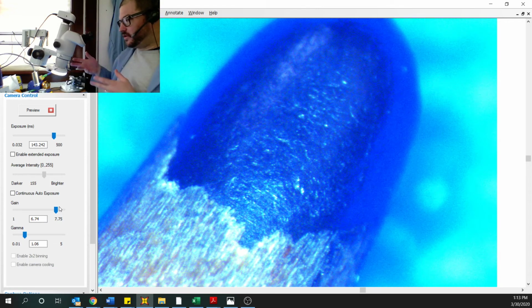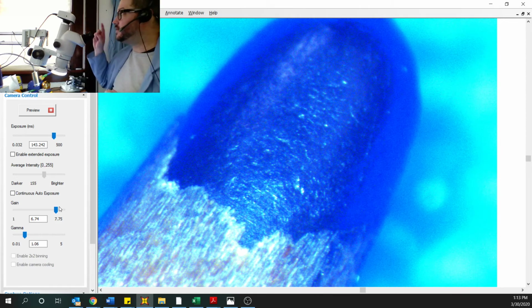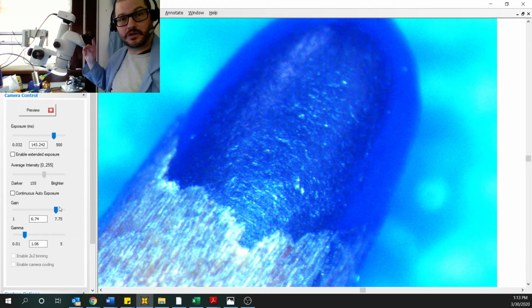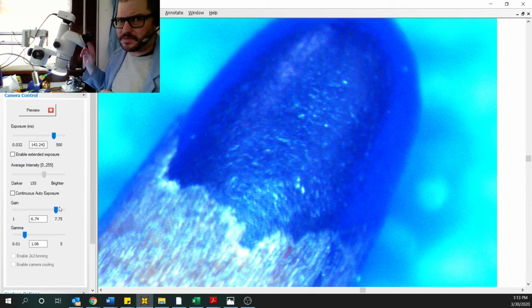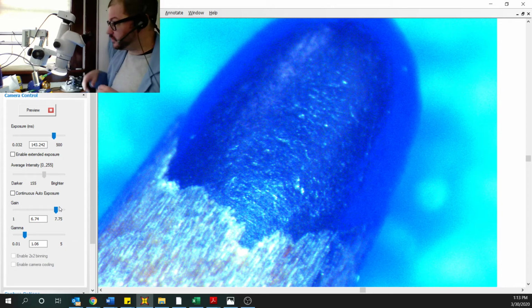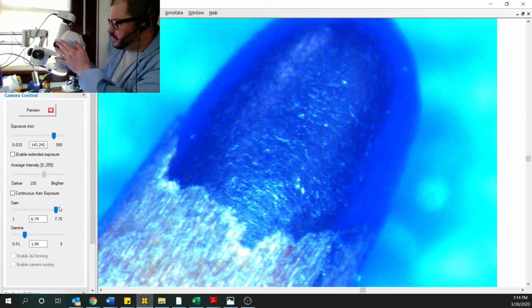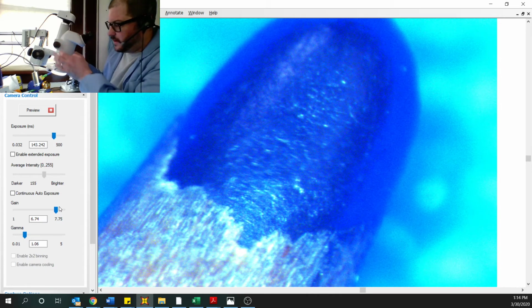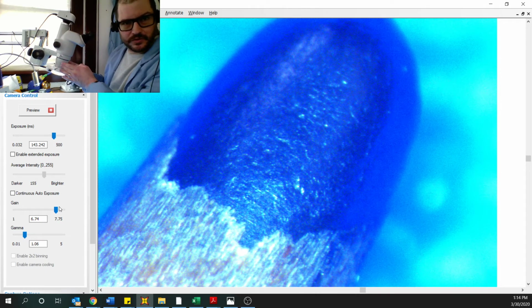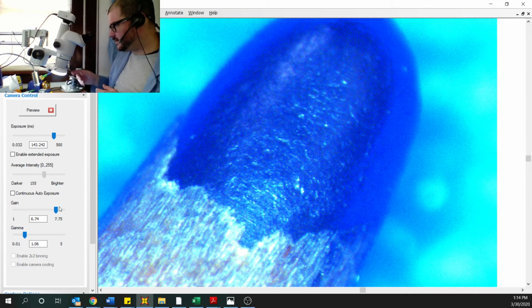But yeah, those are the various parts of a microscope, and that makes up most microscopes that you'll see. You will see the ocular lenses, or what most people call the eyepieces, because that's where we put our eyes when looking through the microscope. There is some sort of zoom mechanism, called a zoom tube on my microscope. There is an objective lens that we usually put something underneath to be able to look at it.